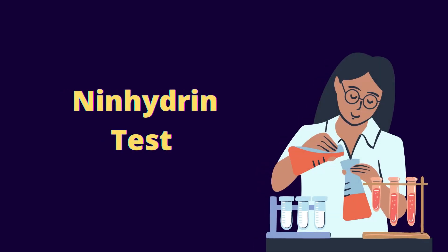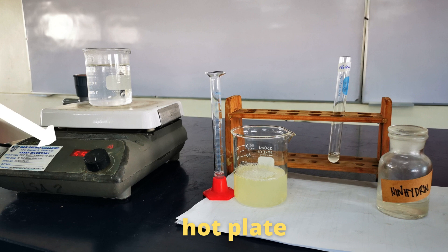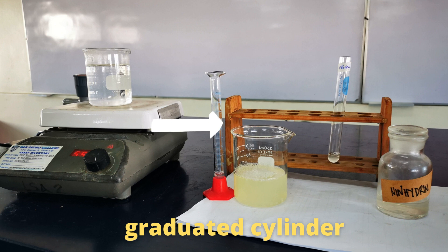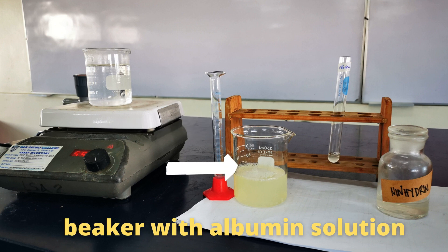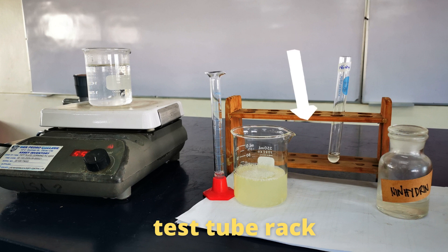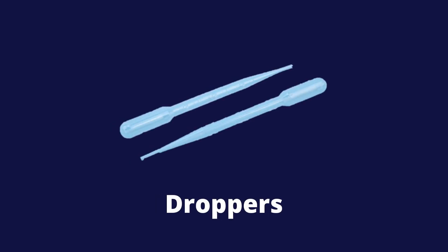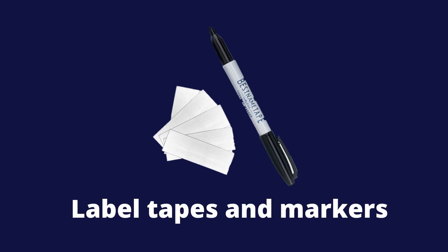Next, we have the ninhydrin test. These are the materials and reagents for ninhydrin test: hot plate, graduated cylinder, beaker with albumin solution, test tube, test tube rack, ninhydrin solution, droppers, label tapes, and markers.